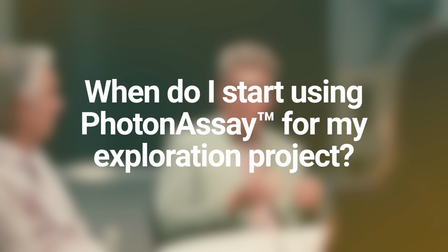And we're obviously coming from a perspective of resource definition, but think about exploration as well. That's another area, one that collectively we have less experience in, but clearly an area where measurement at low grade is important. To be clear, if somebody's looking at 1 ppb or sub-ppb levels, PhotonAssay is not going to be a method that's applicable.